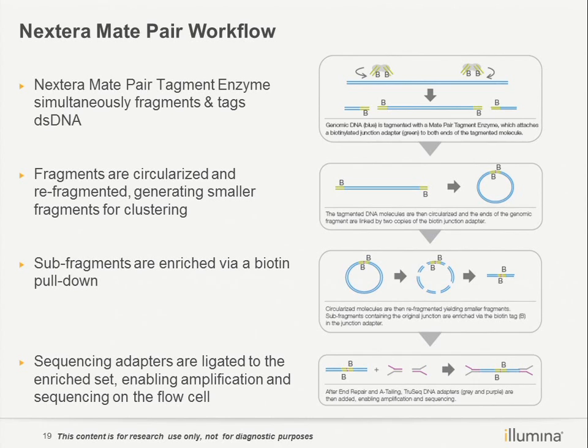Then we circularize it and further fragment it, and we use streptavidin to specifically capture only the fragments with the biotin label.